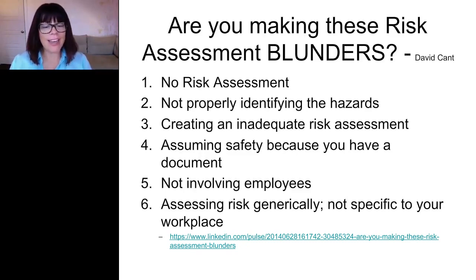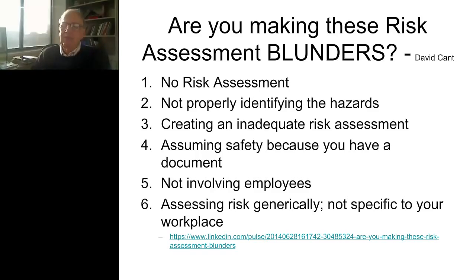Let's get started. Our first question asks, my lab does not allow the use of cell phones in the lab. Are cell phones a biosafety risk? They are definitely a biosafety risk. When you bring a cell phone into the laboratory, you risk contaminating that cell phone with what you're working with in the laboratory. And you also need to consider where you're taking that cell phone afterwards.